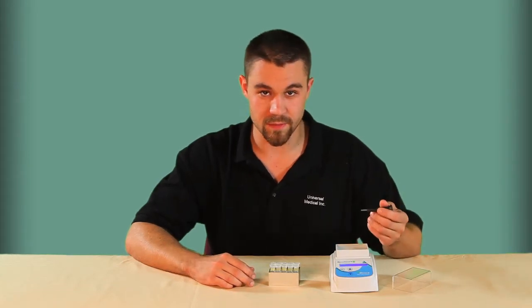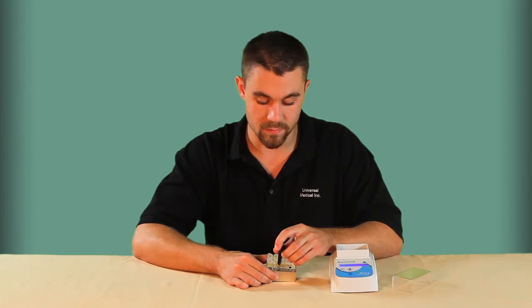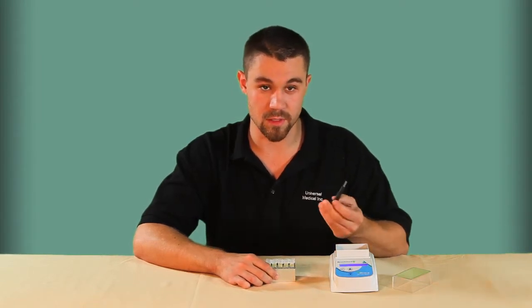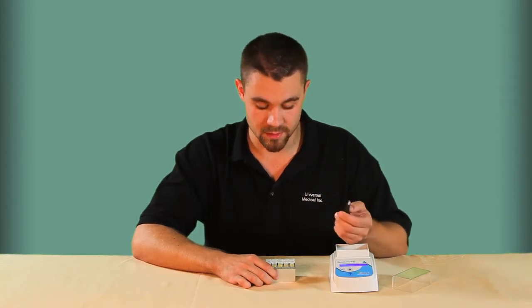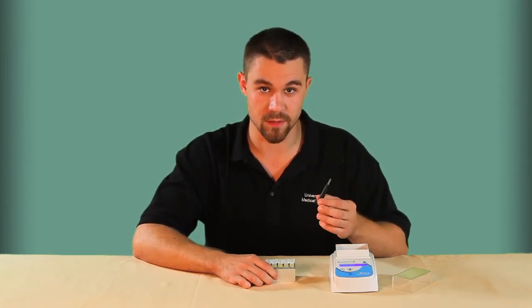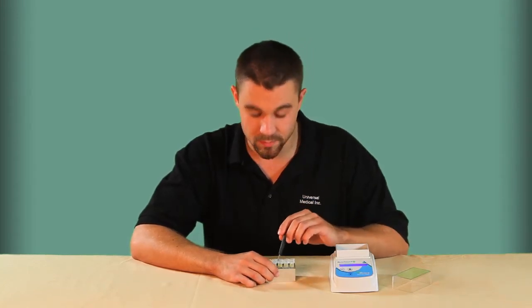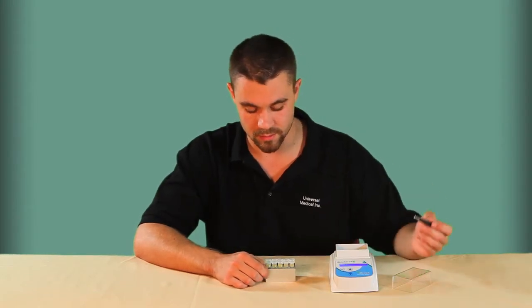One thing I did find difficult was the access to the hole here for the block lifter can be tricky sometimes due to the bulkiness of the lifter. I talked to Benchmark about this and they are considering changing the style block lifter in the future, so with a couple tries you can arrange your microtubes accordingly in order to get the block lifter in there.